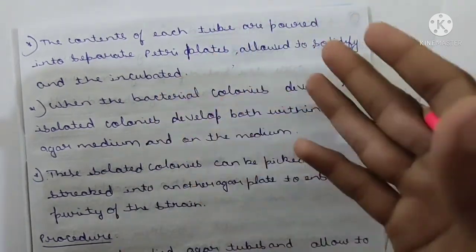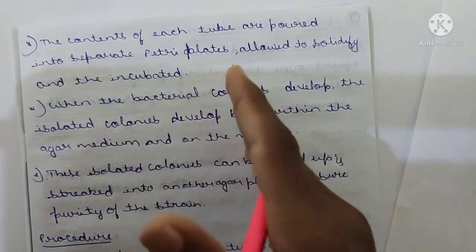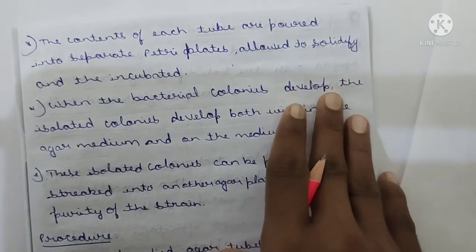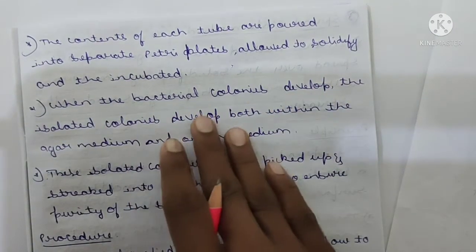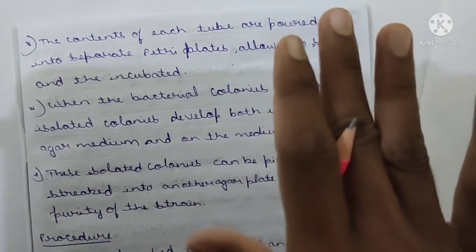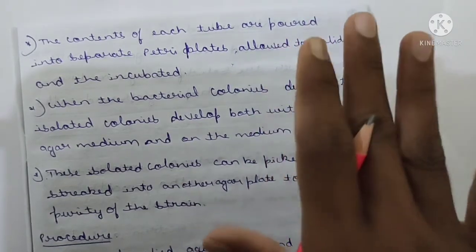separate petri plates, allowed to solidify, and then incubated. We have to pour all the tubes into separate petri plates, allow them to solidify, and afterwards incubate them, meaning we keep them warm in the incubator.